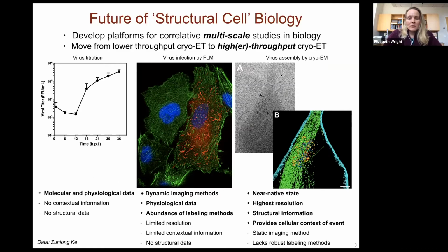And so an example I can give is, since we work on a lot of viruses, we would say, look at this fluorescence image in the middle, and the little red squigglies are RSV virus particles. Everyone asked me, well, which one is the infectious virus? And so I can give a global estimate based on titration data and infectious particles that we can purify out. But to be able to actually pinpoint to a particular virus particle and say that is an infectious agent is really key and critical to our better understanding of these complex systems.